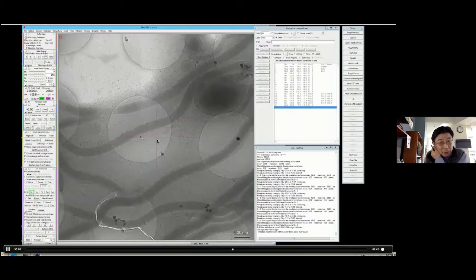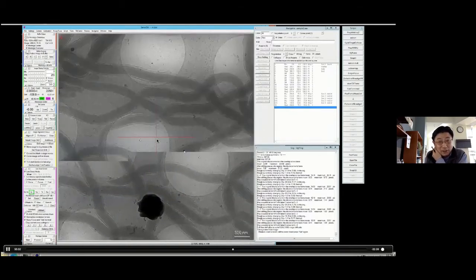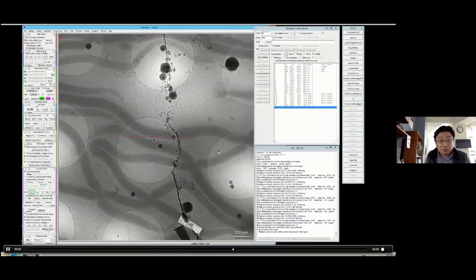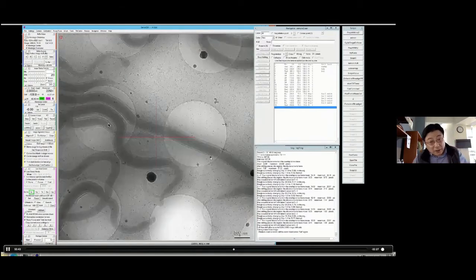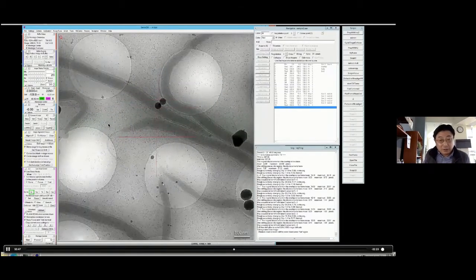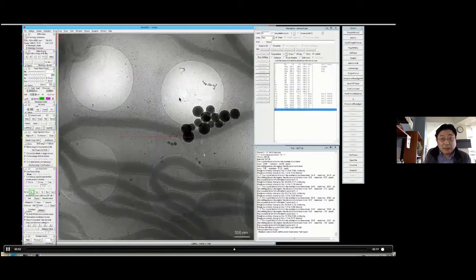As I already mentioned numerous times, this is a war zone, so you really want to be fast. You don't want to wander around or take a break. You want to minimize the time and get in as quickly as you can. For people who can optimize their own sample, this is the basic step.